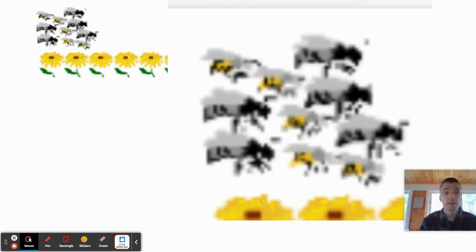Now I want to look at this image to make an analogy with chromatography. It's a little pixelated, and when it zooms in, you may be able to see it a little bit better. So you've got some bees, and you've got some hornets, and you've got some flowers, and they are flying together at the start. All right, so there they are above the flowers. This is going to be an analogy for what happens in chromatography and why it happens.